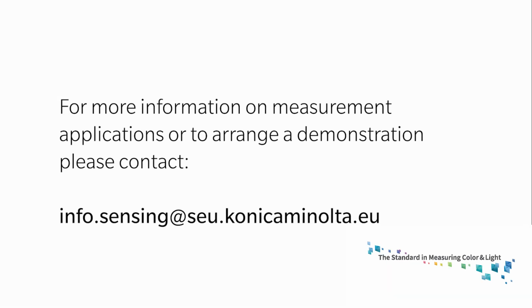So, a Chroma meter isn't for every application. You have no spectral data, no detection of metamerism, no control of the specular reflection. For many industries, a spectral instrument will still be a better tool. But for some industries, like building products, food, etc., the CR-400 or 410 Tristimulus Colorimeter or Chroma Meter performs a task that is simply not otherwise possible.